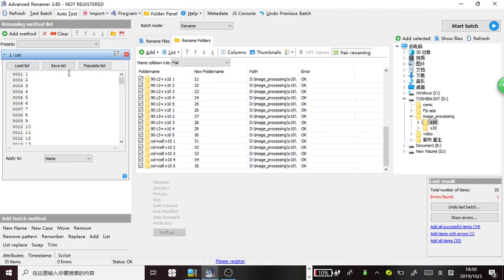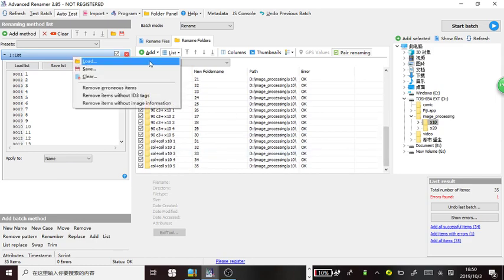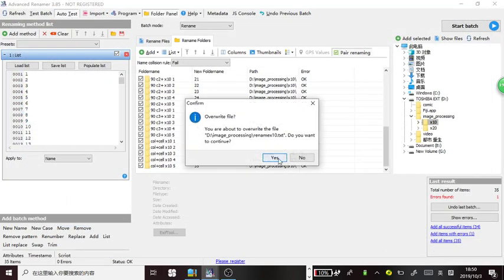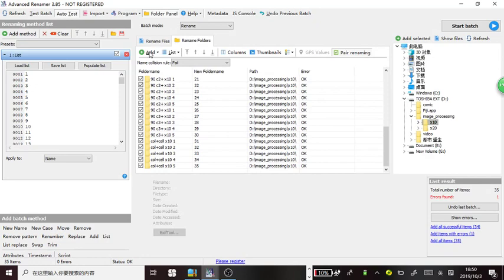Now we can see that because the list has already been loaded, it's here. Now list, save it here, cover it, start batch.